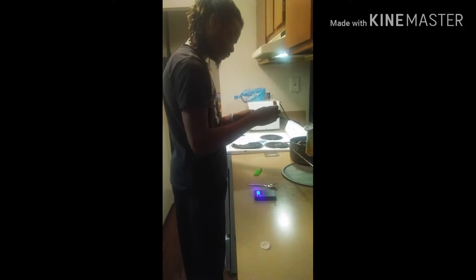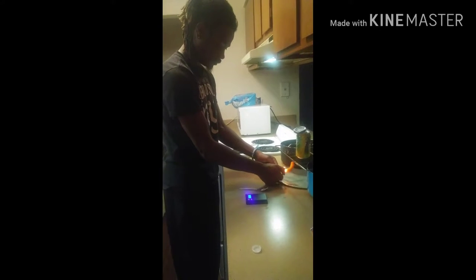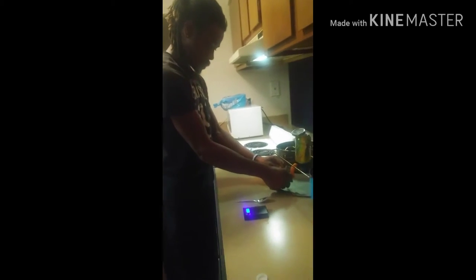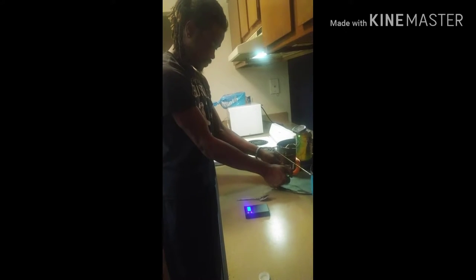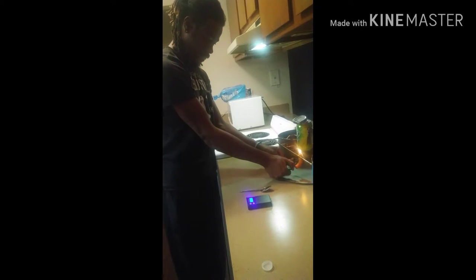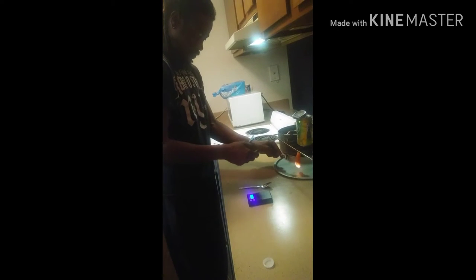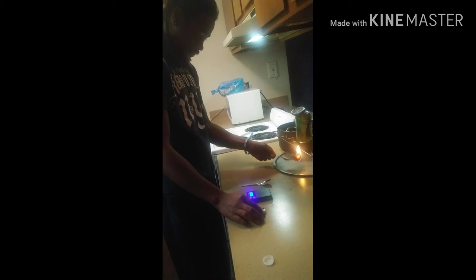Let me go ahead and burn this. That's 1.8. Oh my goodness, this is on fire!